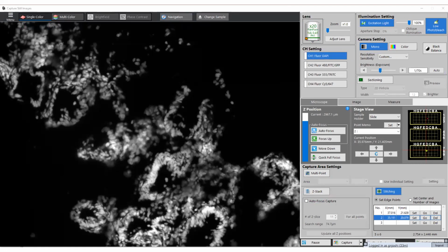So the last bit of thing is capturing your image. If you want to click one image, you hit capture over here. But if you want to acquire a ZStack or a stitched image, you click on this button, which always gets behind this logged window. So you will have to minimize this logged in window frequently and hit this. Now the second thing is, if you are acquiring just one channel, this is what you will use.